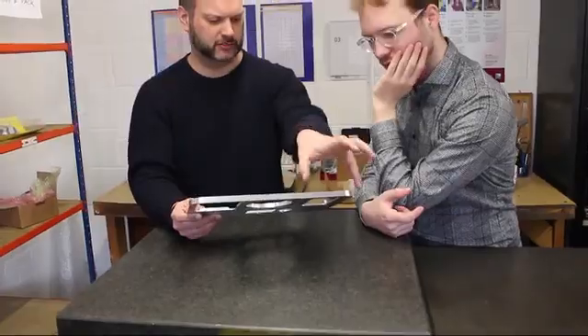BentoLab started with a simple vision that laboratory tools would be accessible for students, teachers, field researchers, citizen scientists, and everybody else who wants to learn about genetics and get involved in biology. We've been beta testing BentoLab for the past six months and we've made a ton of improvements to ensure that BentoLab is robust, professional, and easy to use.